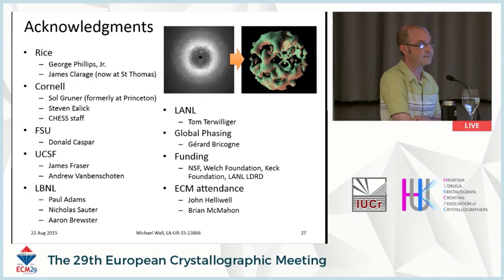And the second is that we can obviously calculate the shape using the parallax, using the various collection, but a spherical detector would be really great for that. And we can manipulate data to present it as a spherical detector. This is something which could be done, and you could try to process the data from the virtual spherical detector.